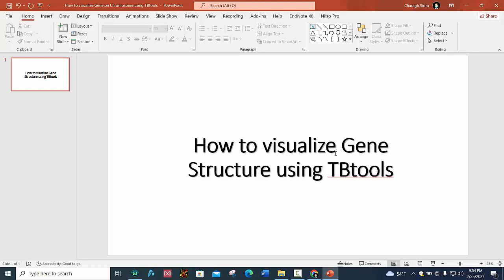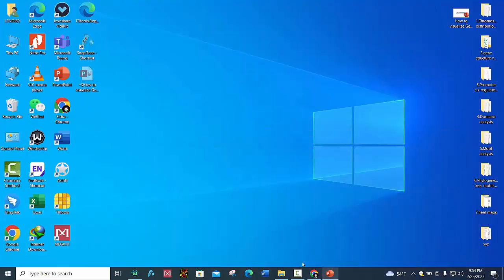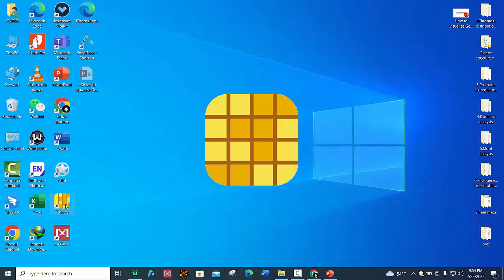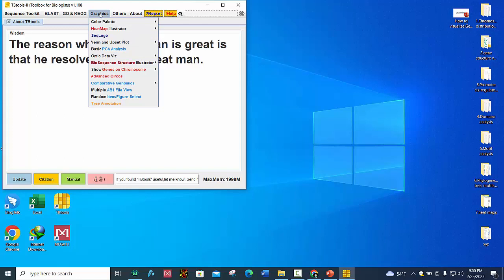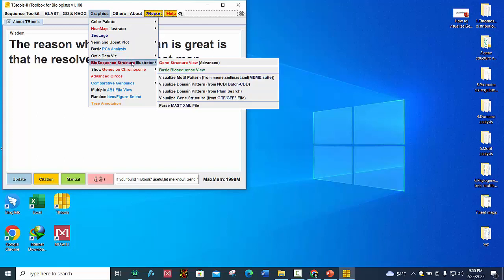We will see how to visualize gene structure using TBtools. First, open your TBtools software and then go to Graphics, go to Bio Sequence Structure Illustrator, and click on Visualize Gene Structure from GTF and GFF file.